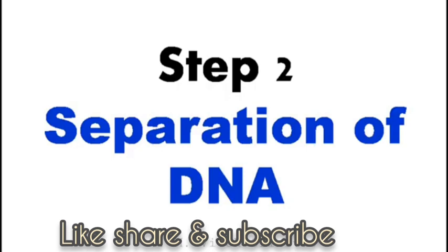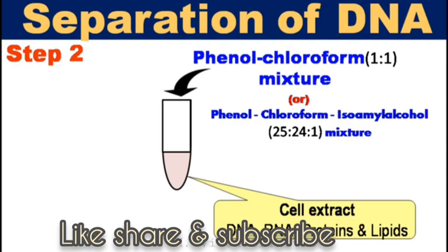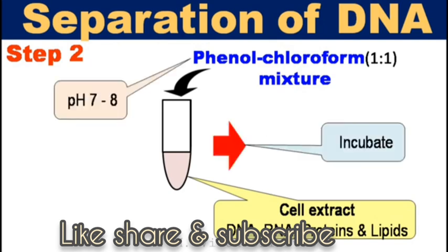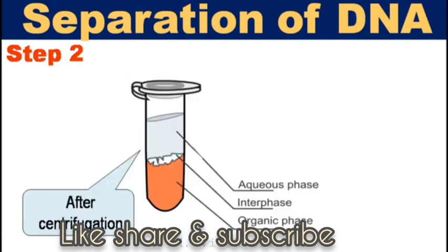Step 2. Extraction or separation of DNA. To the cell extract, add 1 ml of phenol-chloroform mixture, whose pH is 7 to 8. Mix well by inverting and incubate at room temperature for 5 minutes. Phenol and chloroform are used to denature and separate proteins from DNA. Following incubation, centrifuge the mixture at high speed, that is 10,000 rpm for 10 minutes at 4 degrees Celsius. After centrifugation, you can observe the phase separation.